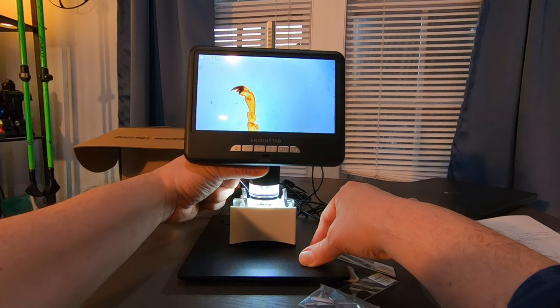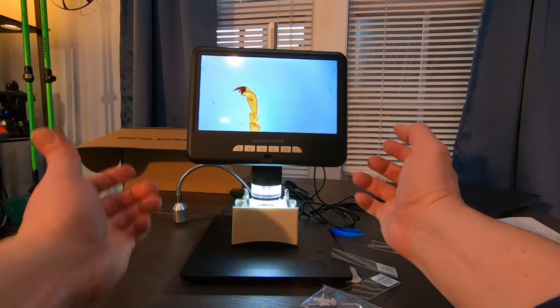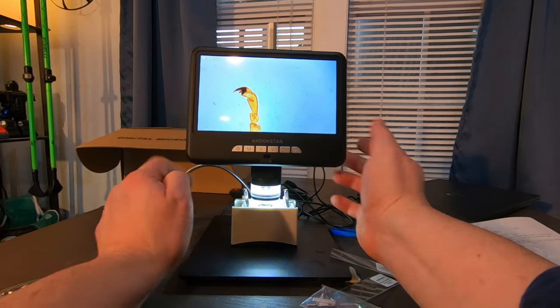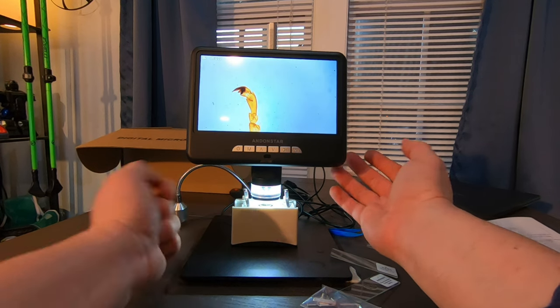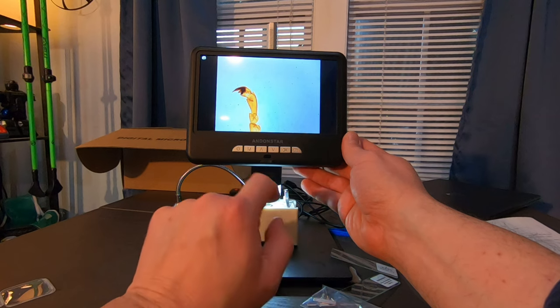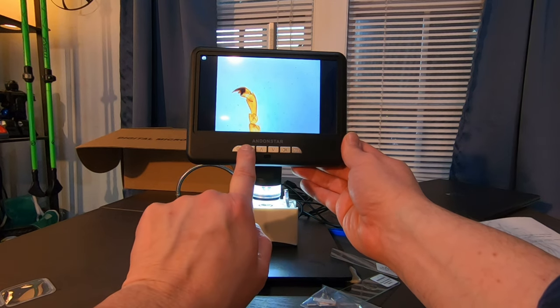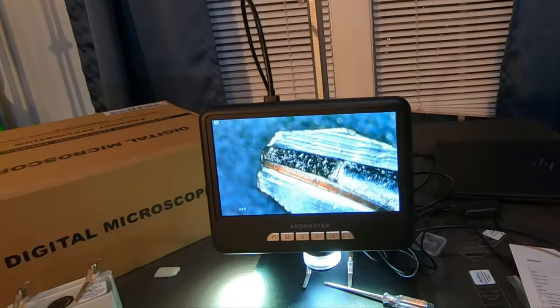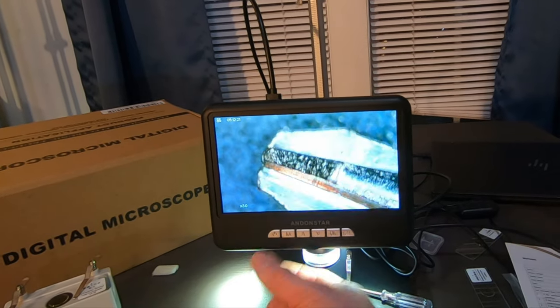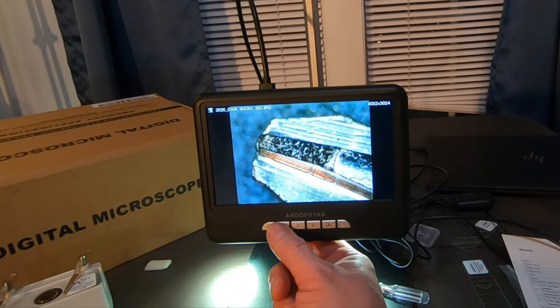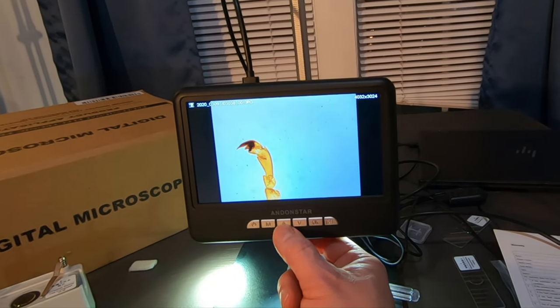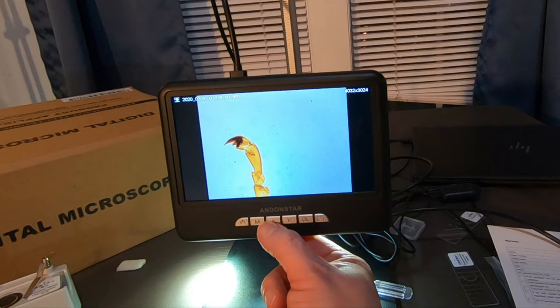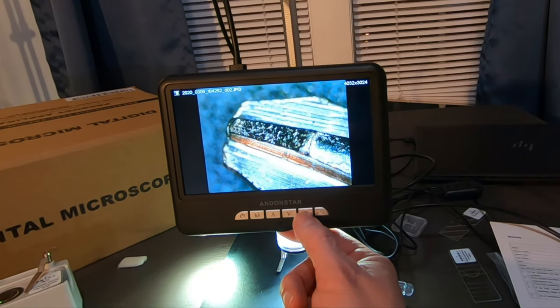You know, when your kids come home and they have a little something in their hair. And there you go. I just took a picture. Hit M. And there's my image. Where is M? There's the image I just took. So I just took a photograph. And then go back to my menu here. And there's the picture that I took a moment ago. There's the leg of the little bee. And back to the picture. Kind of nice. Hit OK. Menu.